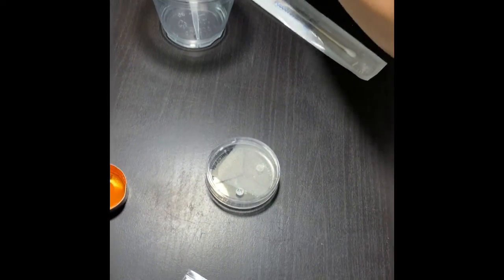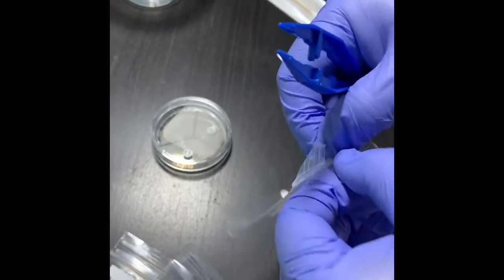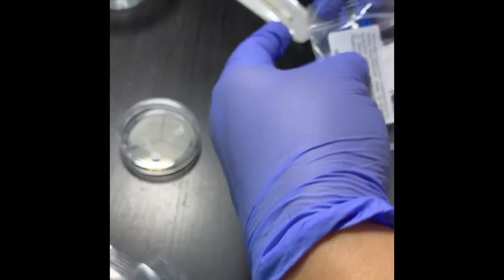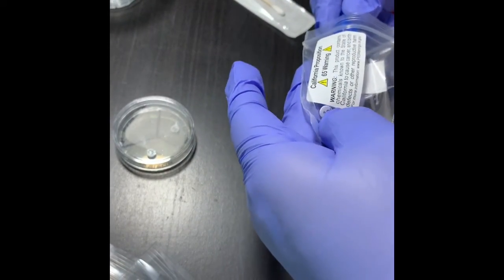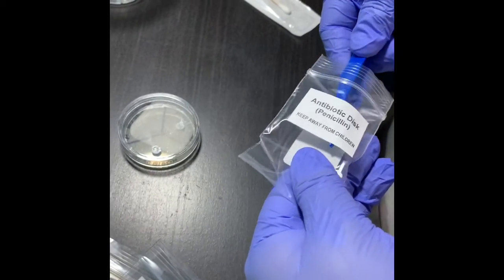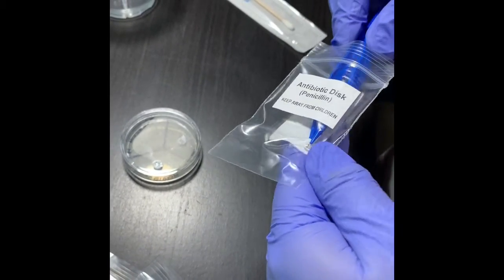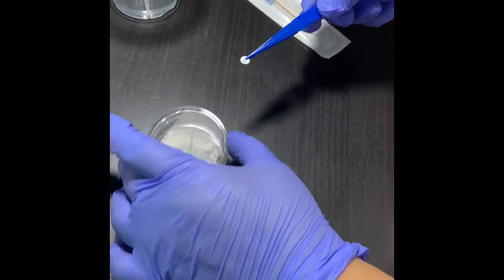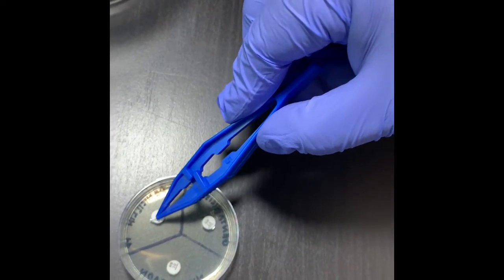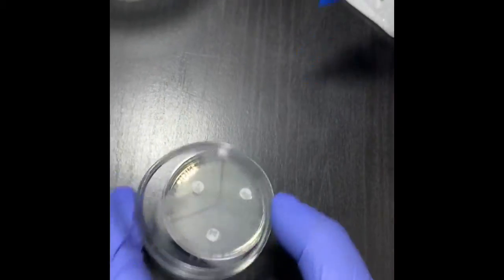Next, the last tablet left is penicillin. I take that and put it over here. I don't need to look at the back because only penicillin is empty, so I keep it here and press a little.